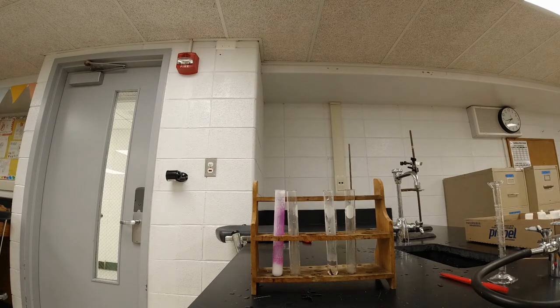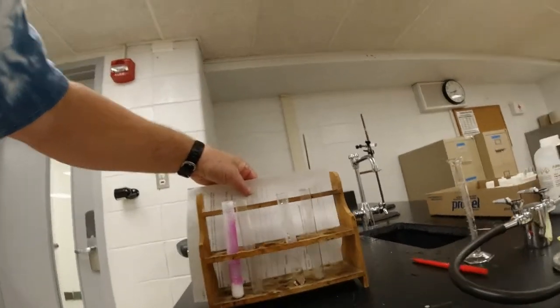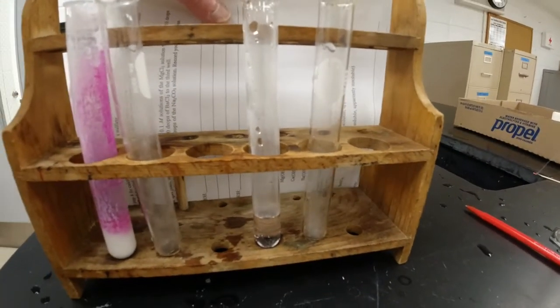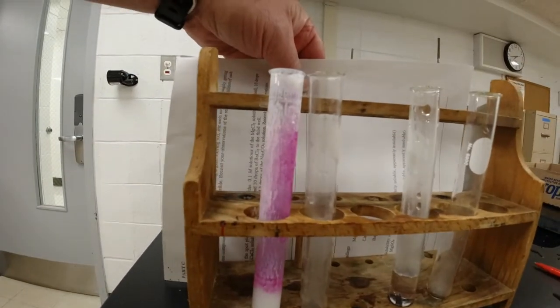So I'm going to let that go for a little while, but I'm going to put a piece of paper behind, and I don't know if you guys can see that or not, but that test tube turns just slightly pink. It's kind of hard to see. Maybe you can see it at that angle a little better. But anyway, it turns slightly pink, while that one is really strongly pink.